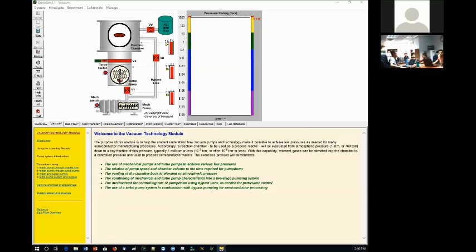All right, now, we will start with the most fundamental thing. We'll just open the mechanical pump like you guys must have done in the lab by clicking on this little button here that I'm emphasizing. So turn it on, and then after that, you will see the pressure change here on the pressure histogram, and also see the change on this gauge here as well, okay?